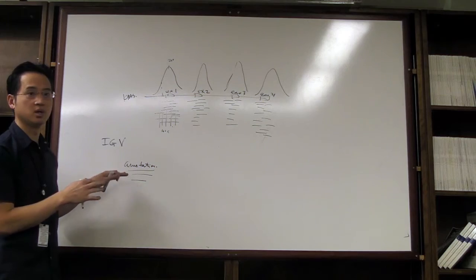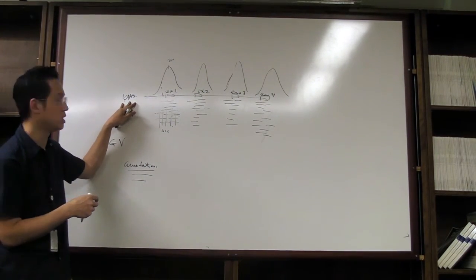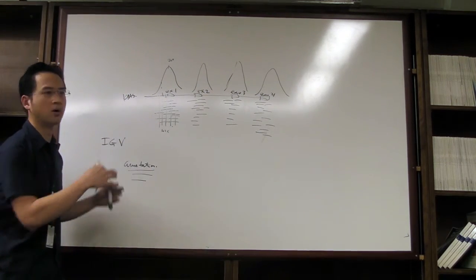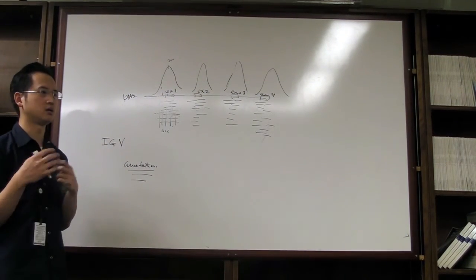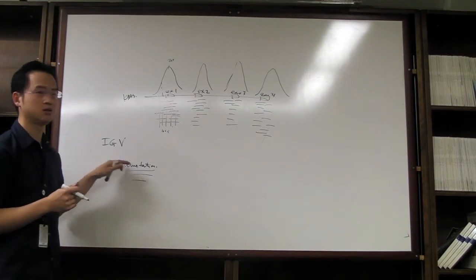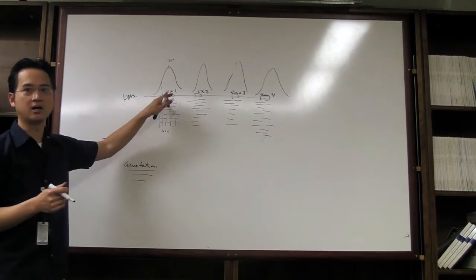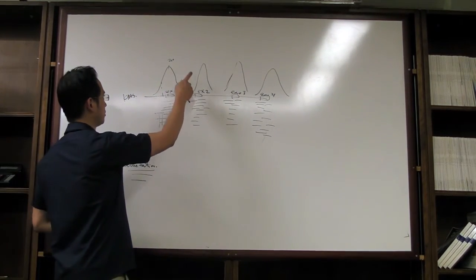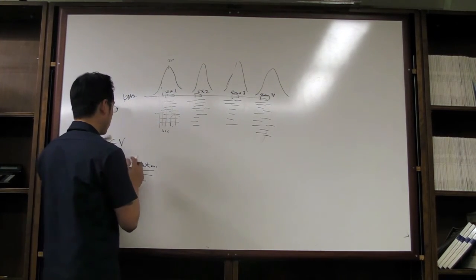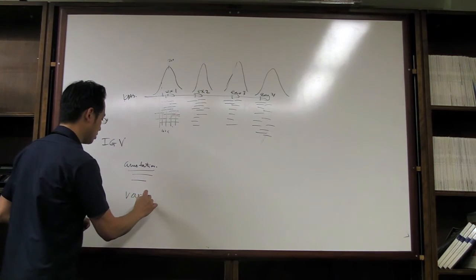And this could be many, many different levels of information. So let's just say we annotated with the gene name, the exon number, the promoter region, the UTR, non-coding RNAs, microRNAs. You can annotate to many, many different levels. It's just basically saying, what am I looking at here? So here I'm looking at exon 2 of KRAS or exon 1. So that's annotation. When you're ready, after you've mapped, then you want to do variant calling.